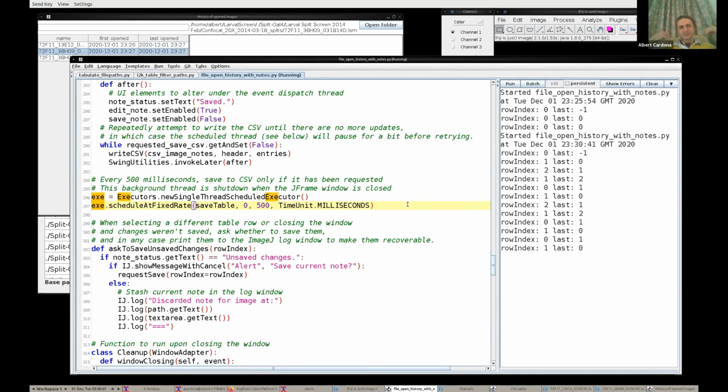But then you can start a new thread for saving this file. Sure. But then if you go and edit the next node and push save again, there's going to be two threads that are saving onto the same file if it took that long to write. Okay? So what you want is to, instead of saving the file, request for the file to be saved.